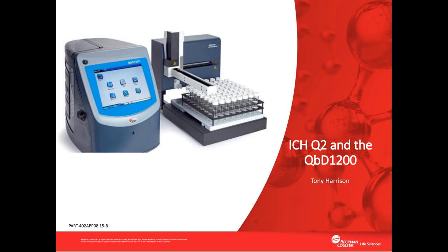Thank you very much for that introduction, and welcome everybody to today's short talk on total organic carbon analysis for the Pharmaceutical Quality Control Laboratory and how it relates to ICH Q2. My name is Tony Harrison. I'm a Senior Manager at Beckman Coulter Life Sciences, and I will be your presenter today. Throughout this presentation, I'll be abbreviating total organic carbon to TOC.